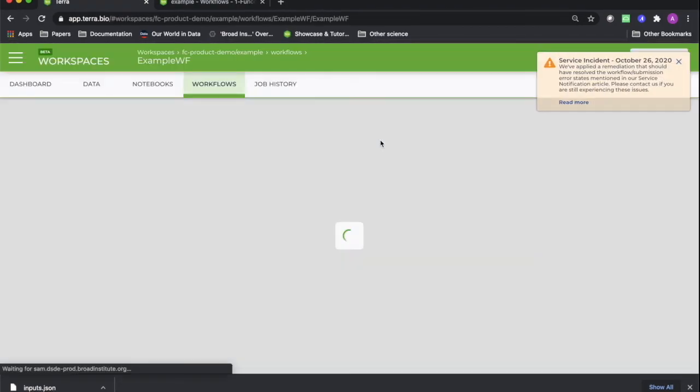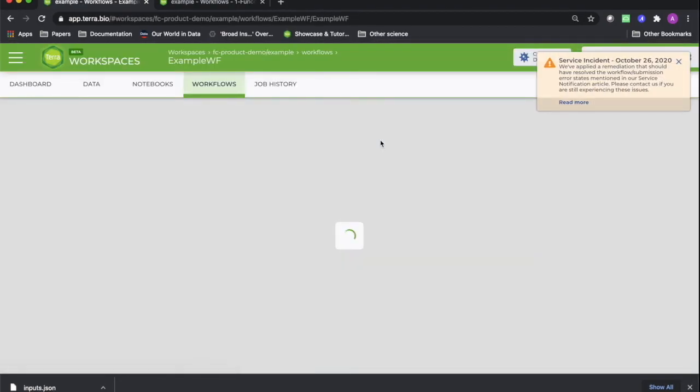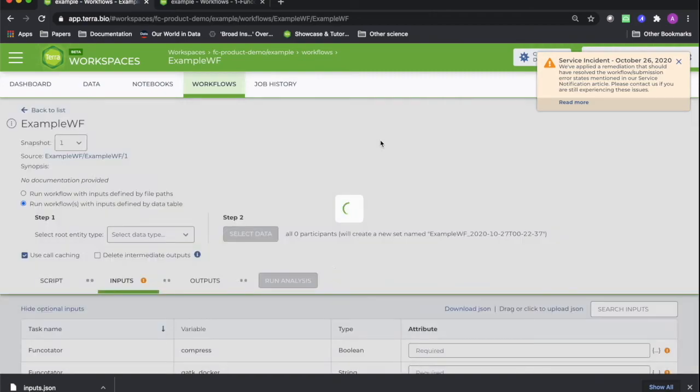Congratulations, you've uploaded your own workflow to your cloned workspace. You can find it under the Workflows tab.